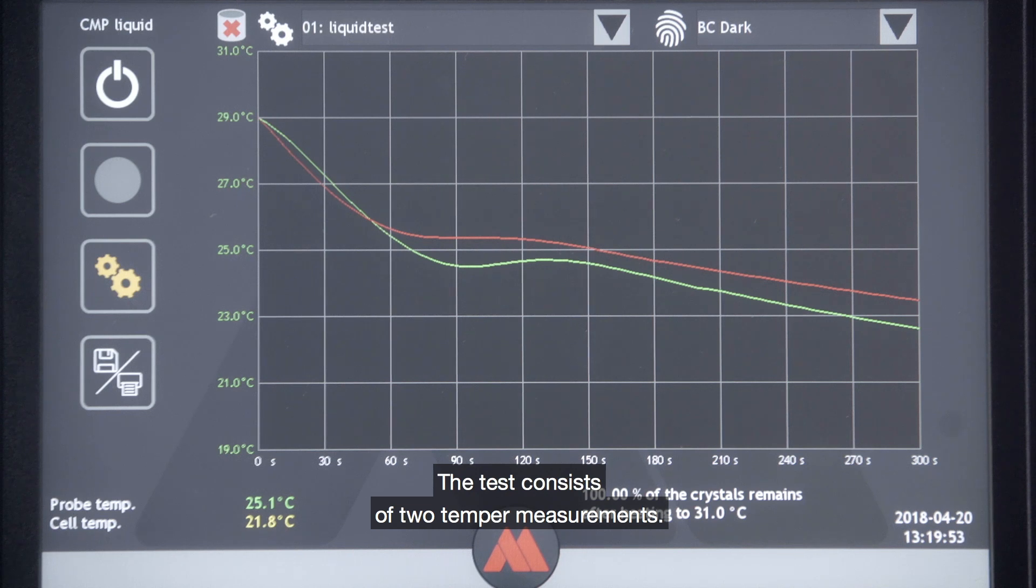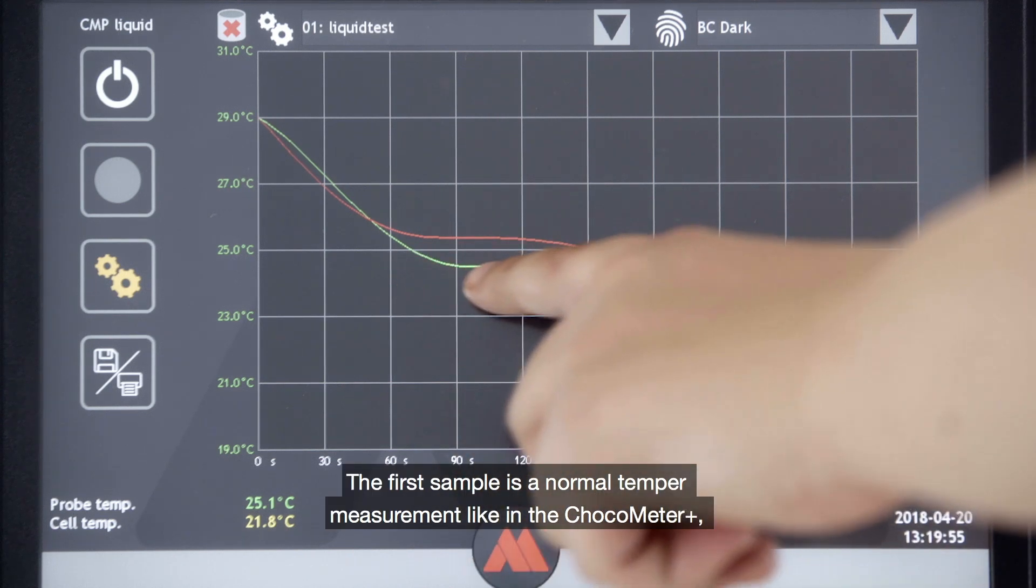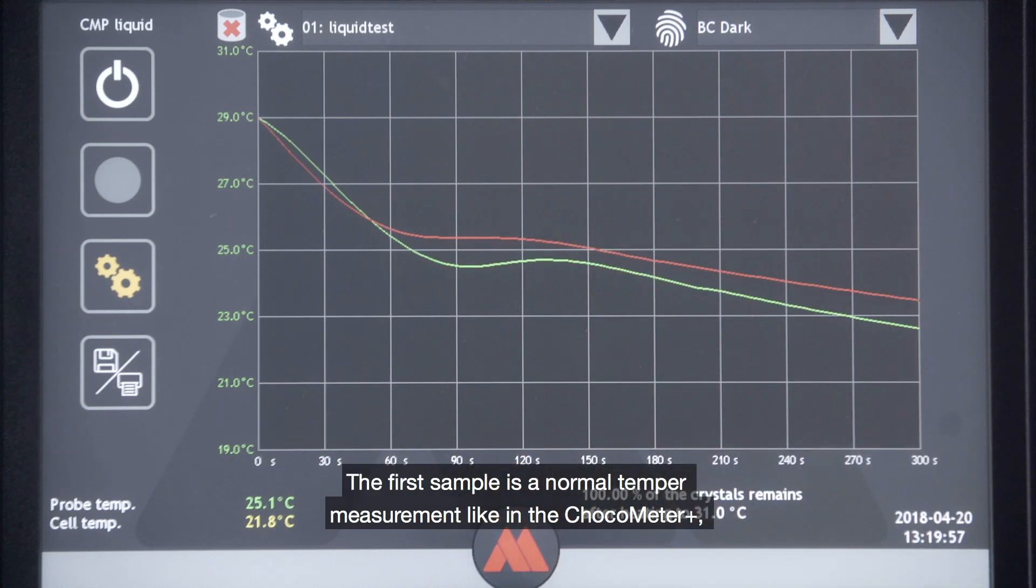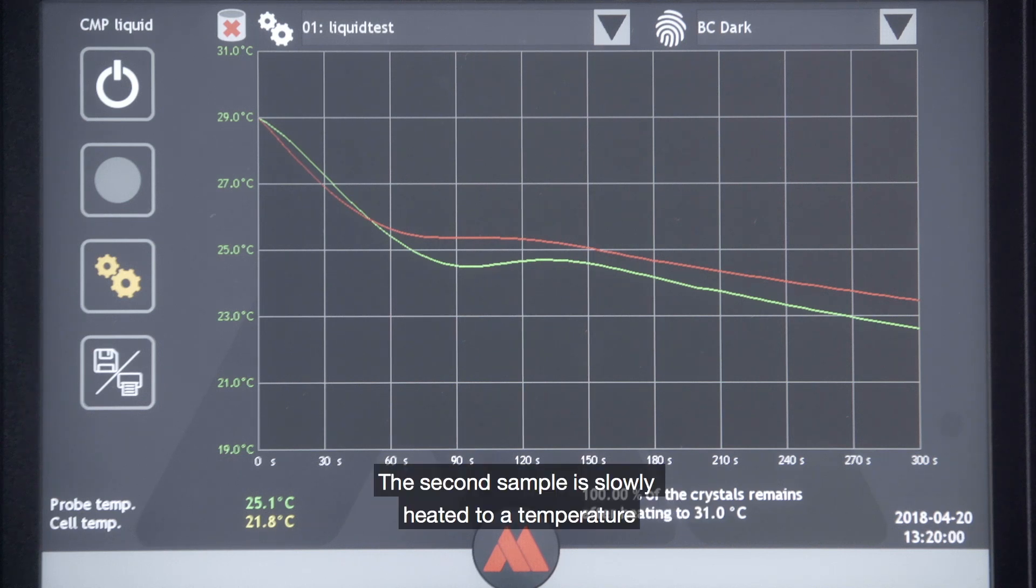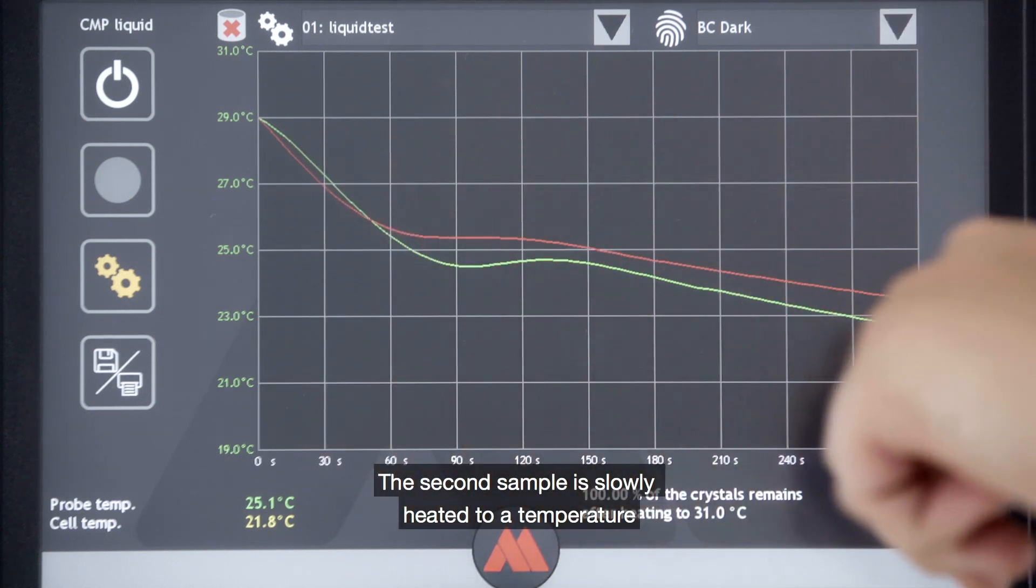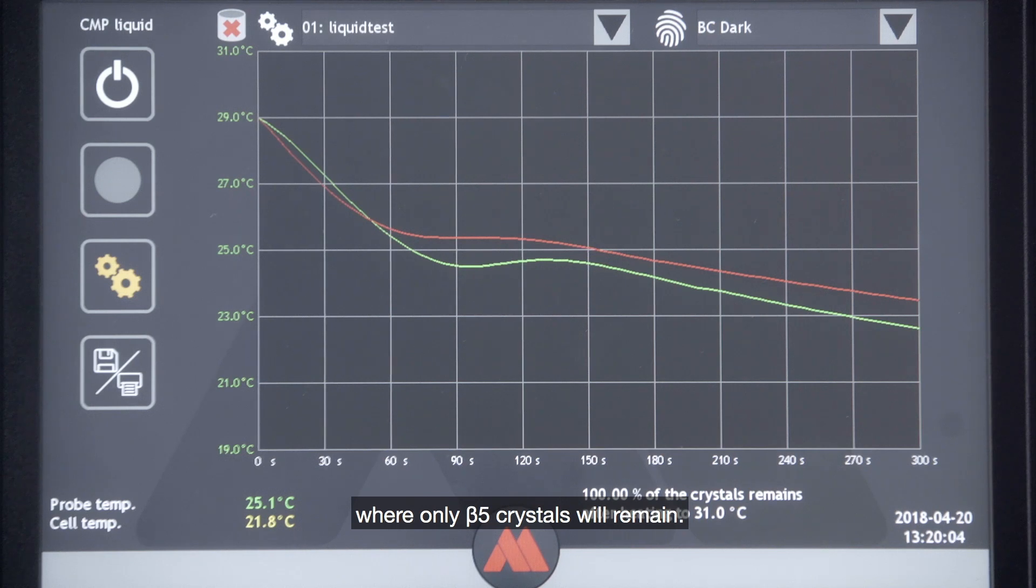The test consists of two temper measurements. The first sample is a normal temper measurement like the ChocoMeter Plus. This is the reference sample. The second sample is slowly heated to a temperature where only beta five crystals will remain.